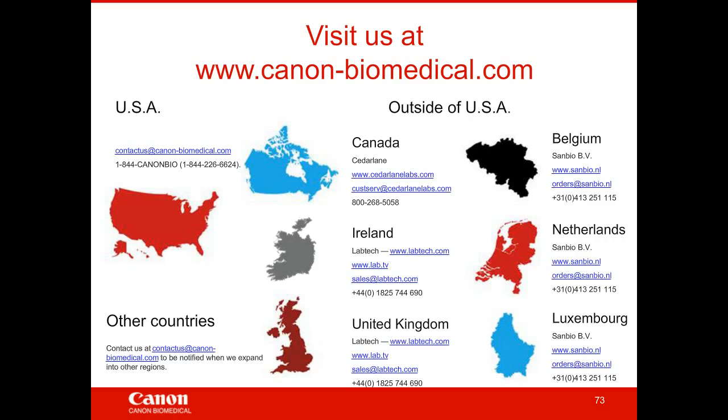Great, thank you. Our next question from our audience is, can you multiplex using these products? Another good question. So these assays use one dye, and so they are not multiplex capable. We do offer some assays that are multi-target, which means they're able to discriminate between more than one SNP or indel within the same gene. But again, all of our assays are singleplex.